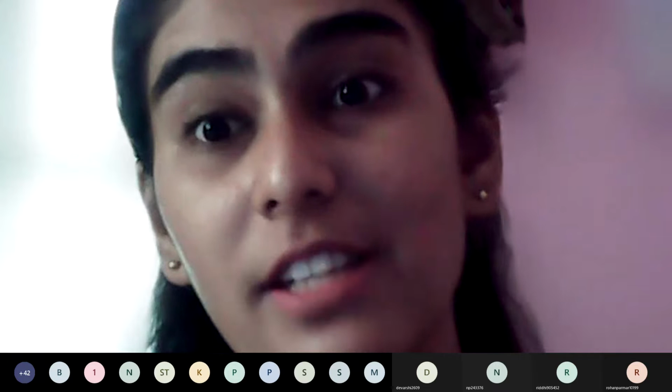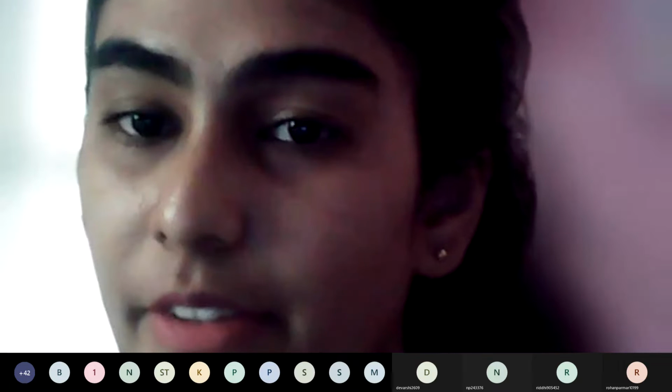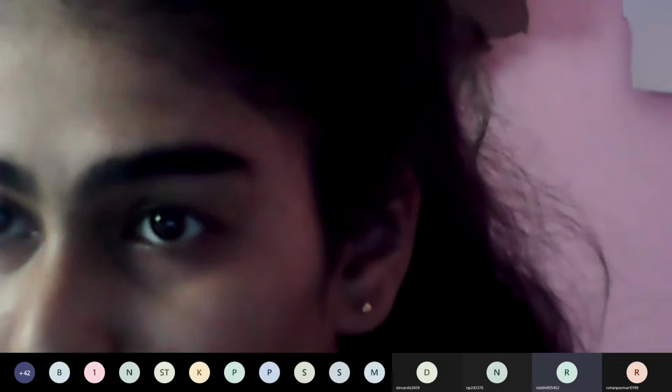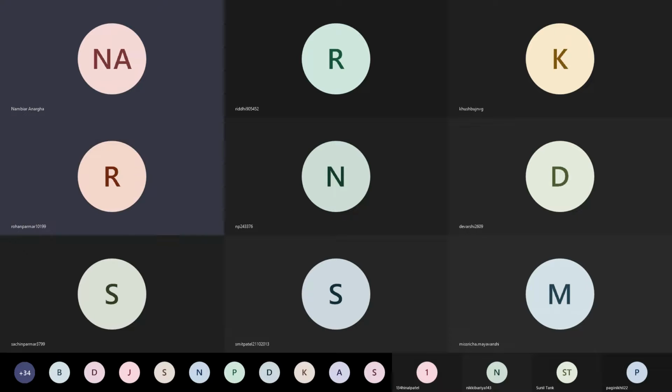Now tell me, is the stationary phase in TLC polar or non-polar, and how do you understand what is polar and non-polar? Yes, ma'am. Water likely means polar solvent, and water not likely means non-polar solvent. अब वाटर नॉट लाइकली मेरे को समझ में नहीं आता, थोड़ा सा इलैबोरेट कर सकते हो? Hydrophobic, ma'am. Okay, fine. Hydrophobic. Okay, fine.